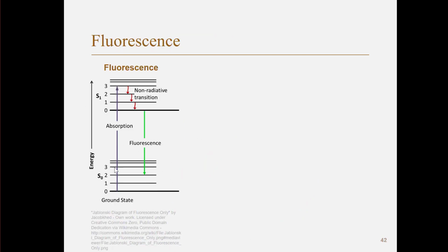What happens here is we have an energy level diagram, something like the one I see here. The photons coming out from the blue LED are absorbed and excite up to some higher lying level here. Then we have a very fast non-radiative decay down to the level here. From this level we have fluorescence, and this fluorescence can fall down into a broad band down here. That means we will get fluorescence over a broad wavelength range, and that's the rest of the light we see coming out.